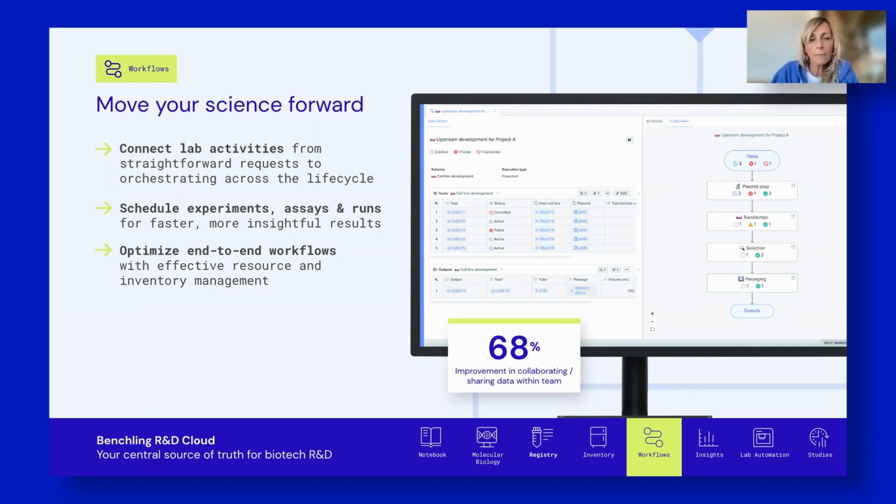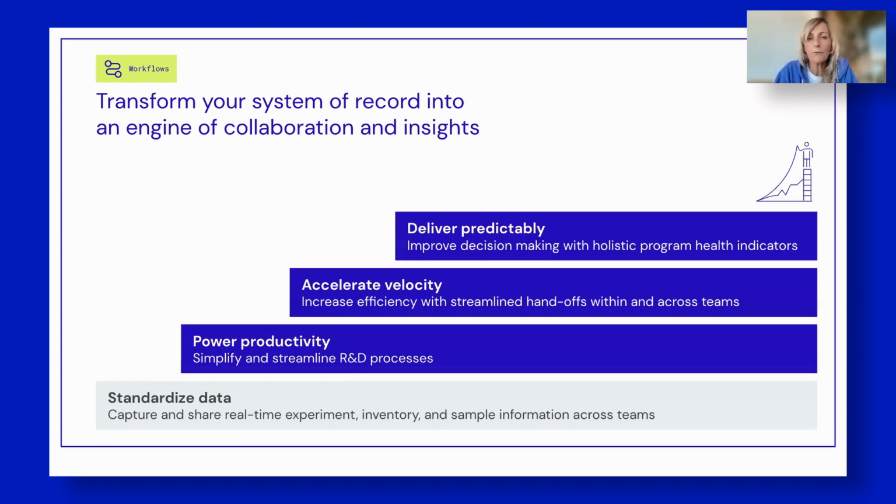By doing all this process-driven work in Benchling, workflows transform Benchling from a system of record to an engine of collaboration and insights. This means rather than having data simply accessible in a shared system, workflows uses the same data to power the work itself.